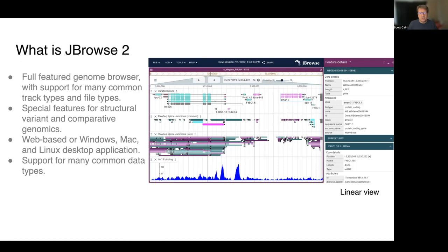JBrowse2 is a fully featured genome browser. It has support for many common track types and file types, and it has special features for doing structural variant analysis as well as comparative genomics. It is a web-based application or a Windows, Mac, and Linux desktop application, and they show the same feature set across them, with support for many common data types.